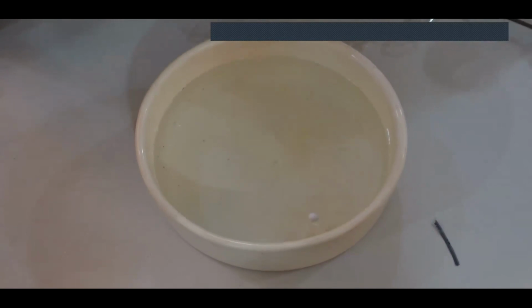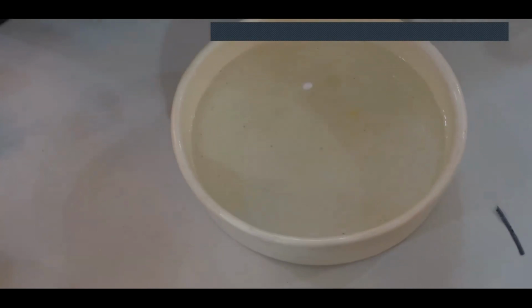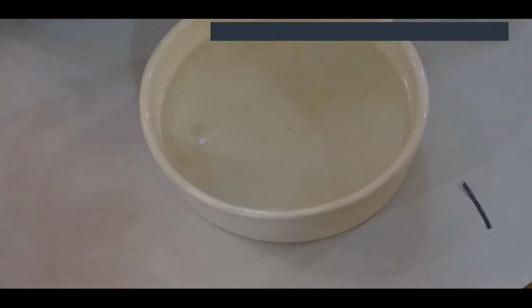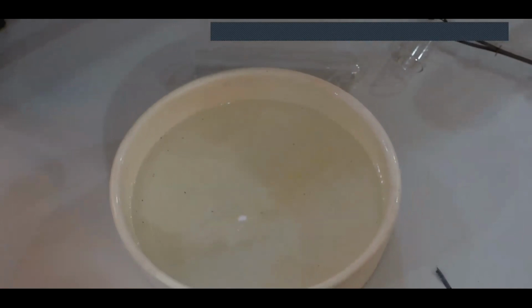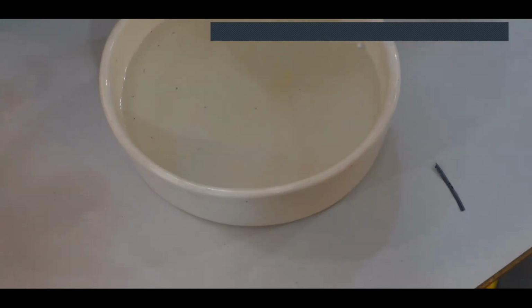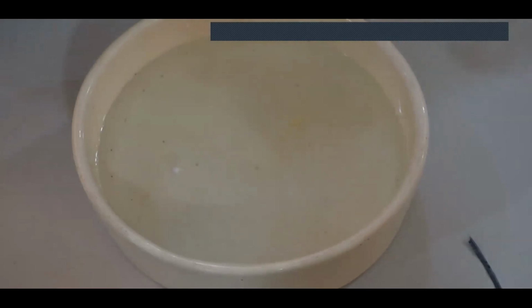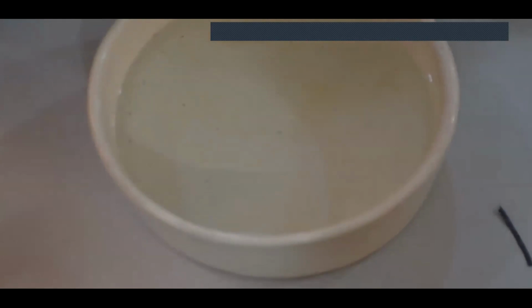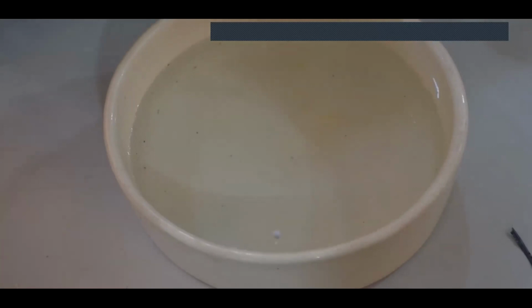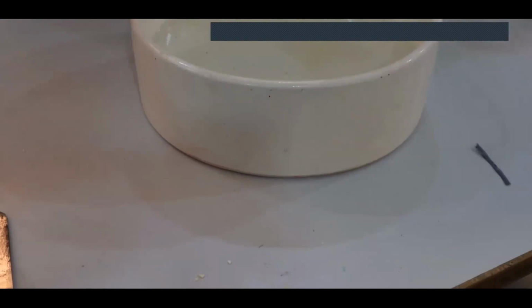What do you see? What's happening? Observations. There's fizzing. There's a small cloud over there, right? It is floating. Very good. It did not sink. What else? Did you see small sparks flying around? So why is this floating? Why is this fizzing? There must be some gas coming out.